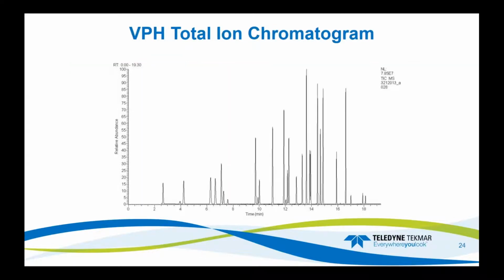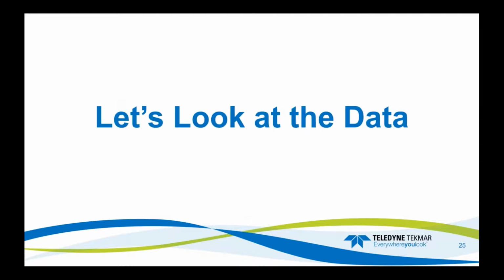This is what the chromatogram looked like. Very good peak separation, very nice sharp peaks. So let's look at the data.